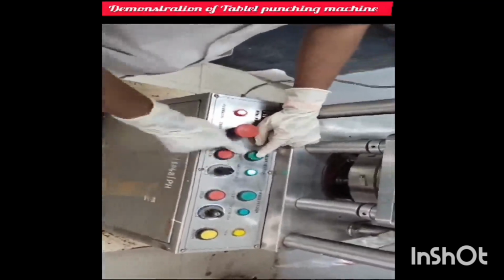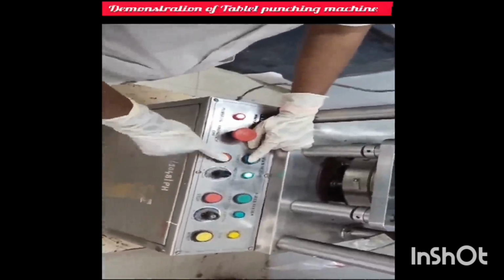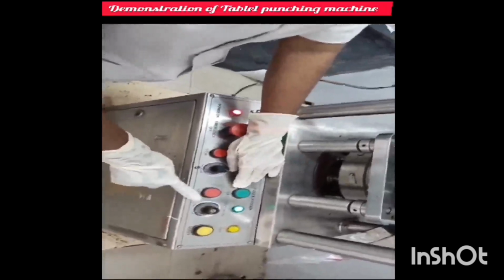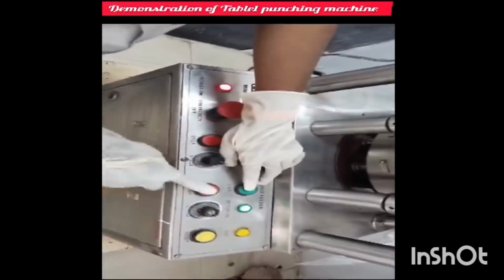After starting, this main motor helps to maintain the speed of the dies and punches. Now here is the force feeder. Force feeder is basically used to maintain or decide the amount of feed, or the force of the feeder that gets into the dies and punches.